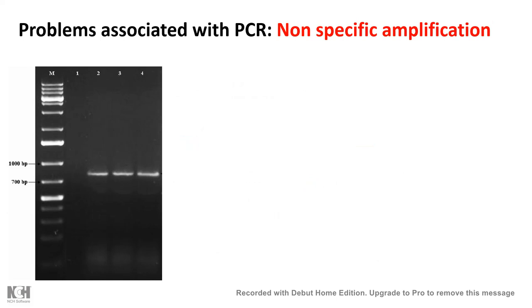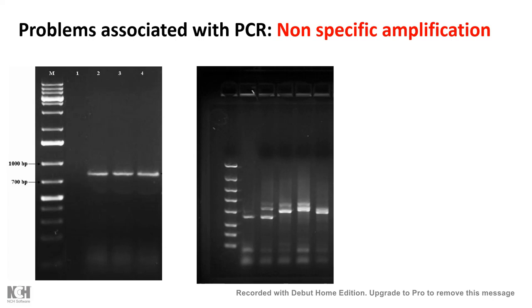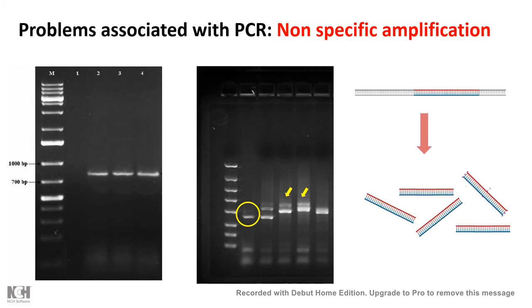Now let's discuss the problems associated with PCR. One problem is non-specific amplification — you get bands in regions where you are not supposed to get them. You might get your desired band, but along with it you get non-specific bands. As you can see, this is our desired band size, but there are multiple other bands at other lengths. It turns out that along with your sequence of interest, some random sequences are also getting amplified, causing this non-specificity.